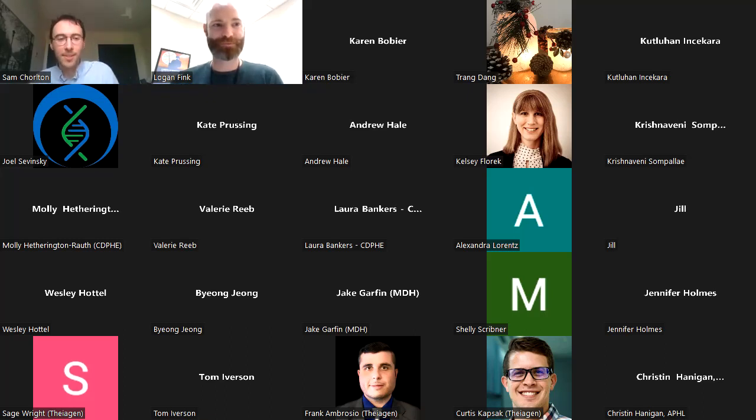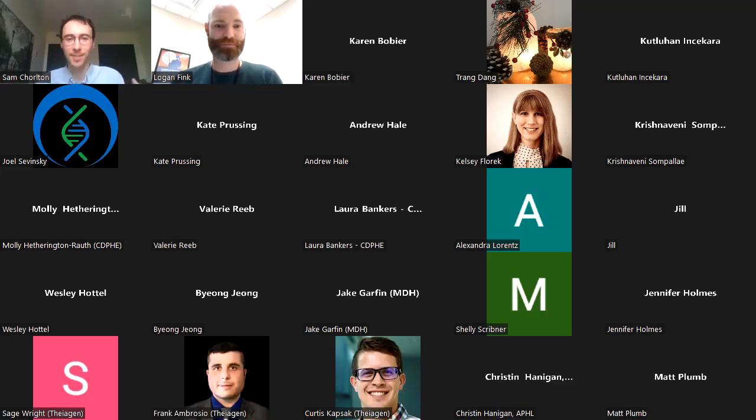Yeah, so we don't let users go in and actually change the code, but we're open to user suggestions to change anything in their own personal results. I can give you a couple examples. BugSeq right now powers anthrax analysis as part of a pilot program at the CDC for bioterrorism. They are very concerned with detection of genetic engineering, as well as the reporting so that LRN members can interpret the results. So they said, we want an executive summary at the top saying whether you need to phone the CDC or not about the results. And we could easily put that into the results. That's based on whether there's AMR detected, whether there are plasmids detected, et cetera. And so we can take what our users want.